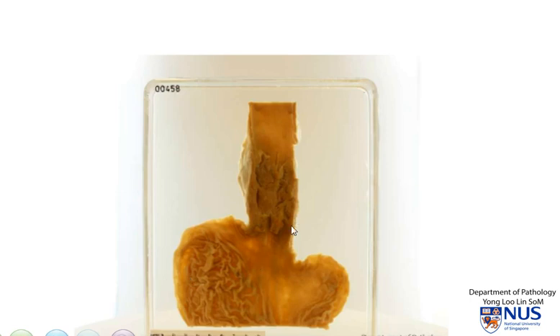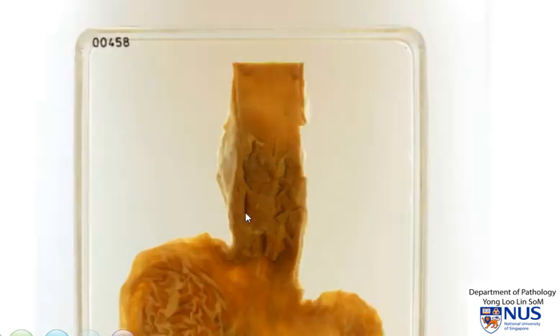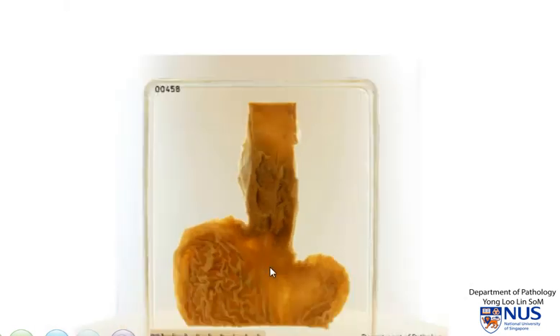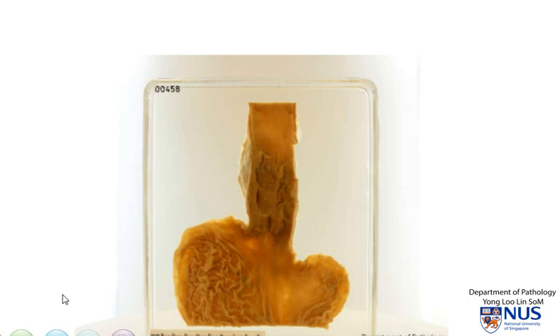To summarise, this is a specimen showing the distal esophagus, the gastroesophageal junction, and the proximal stomach. There is a tumour arising from the mucosa in the distal esophagus, and the possibilities include adenocarcinoma with Barrett's esophagitis as a risk factor, or squamous cell carcinoma.